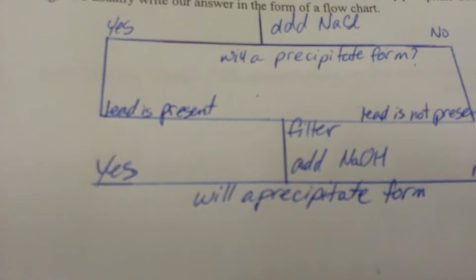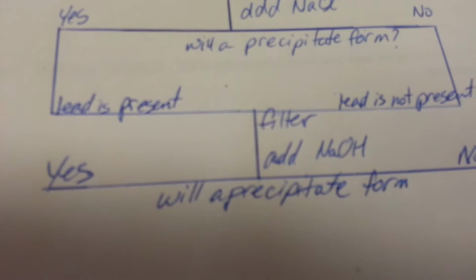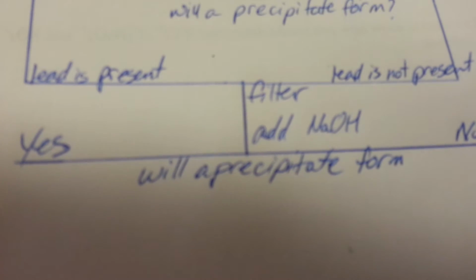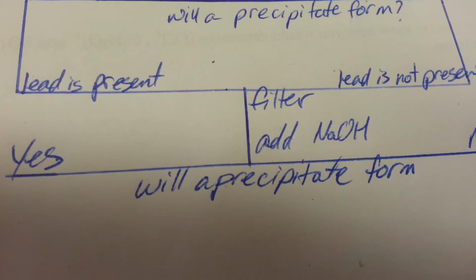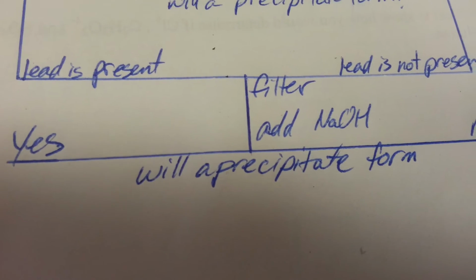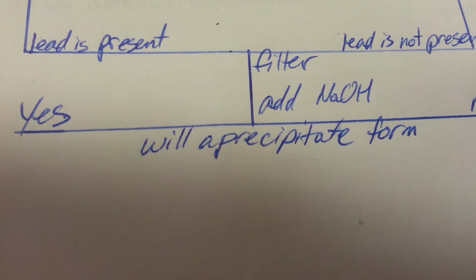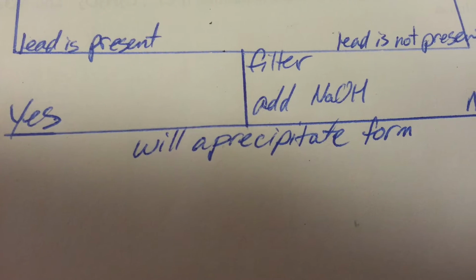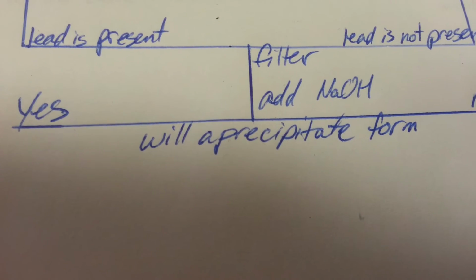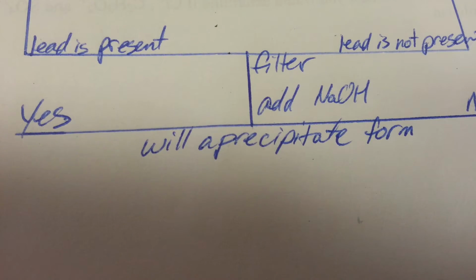Similar to the chloride situation, we want to use something that is fairly common, fairly safe. Now, I've stressed in class that the sodium hydroxide is a fairly dangerous substance, but it's fairly common. It's a household product that we've utilized in some drain cleaners and such. So this is fairly common, it's fairly inexpensive, and if we perform it well, it's fairly safe to use as well. So our situation is we're going to add sodium hydroxide to our solution.